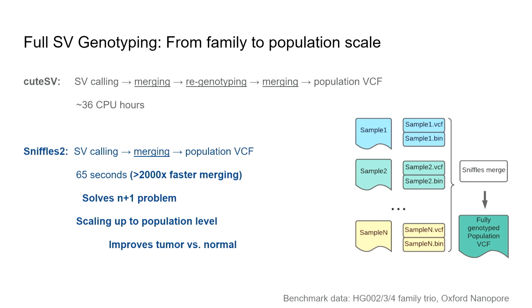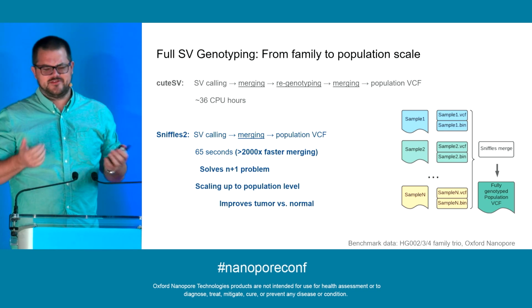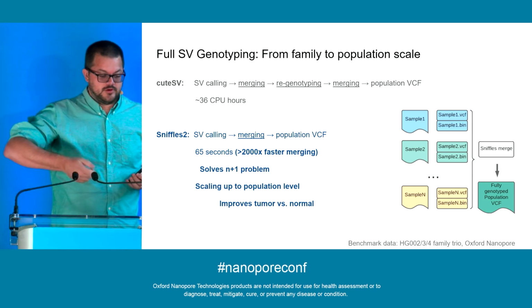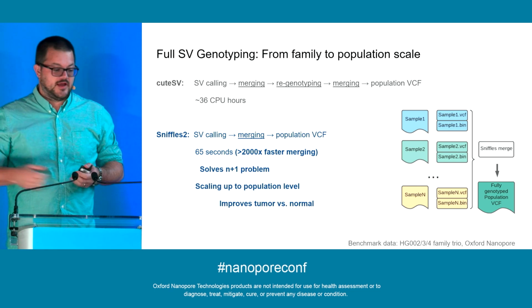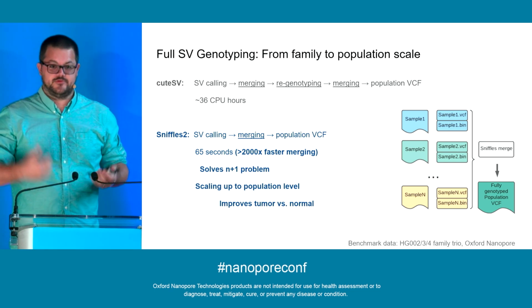So what we have come up with in Sniffles is to actually store all the candidate SVs, even if they are just reported by one single read, in a binary file that comes out of Sniffles if you add the tag --snf. And this binary file is typically on the size of 12 to 20, 30 MB, so it's very small and manageable, right? And then when we invoke Sniffles merging operations, which is a separate parameter, you can feed in all the SNF files that you have, and that automatically generates a fully genotyped VCF file. So you don't have to go back and forth.